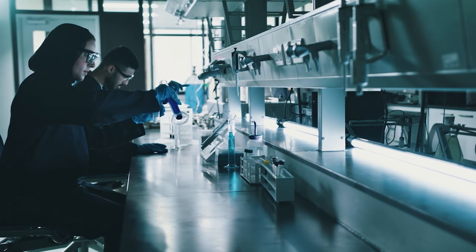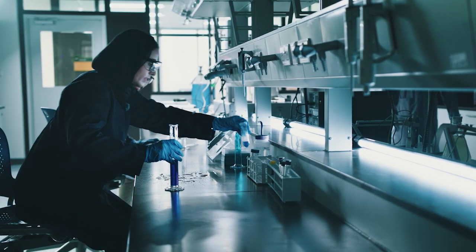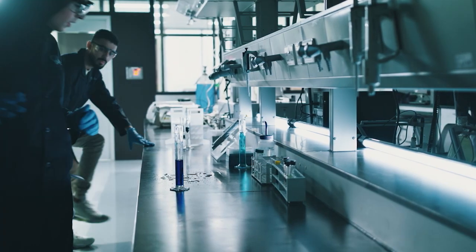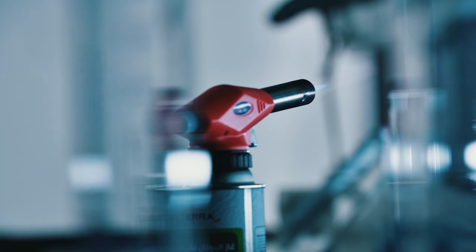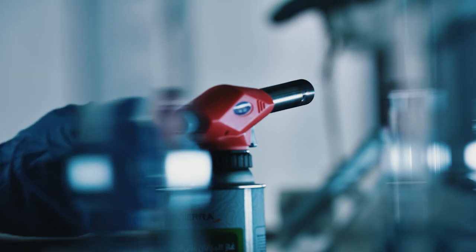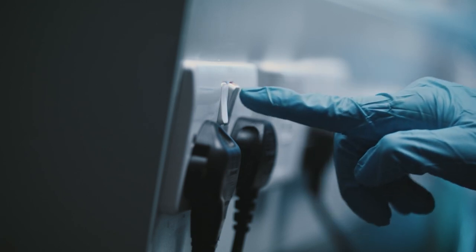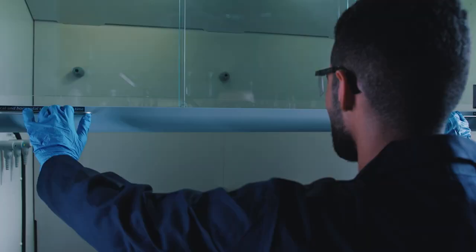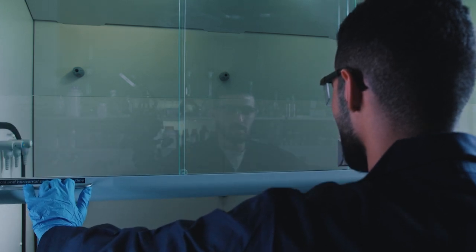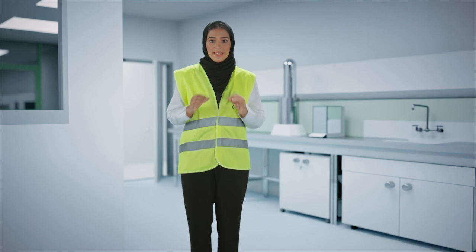If you or someone near your workplace has a chemical spill, you and other students in the area should move away from the spill. If a flammable liquid is spilled, warn other students in the area to extinguish all flames and turn off electrical equipment, if you can do so without putting yourself in harm's way. If the spill occurs in a chemical hood, close the hood sash to allow the vapors to be removed more effectively. You should report the spill to your instructor immediately. Your instructor should know how to handle the spill.